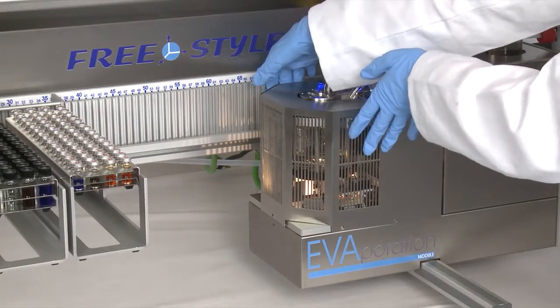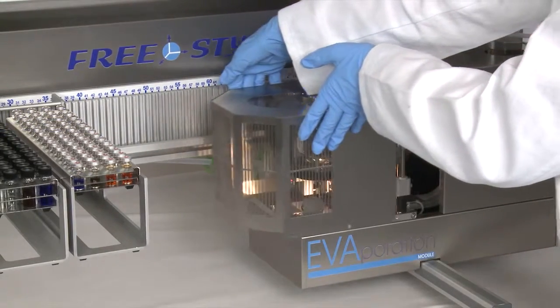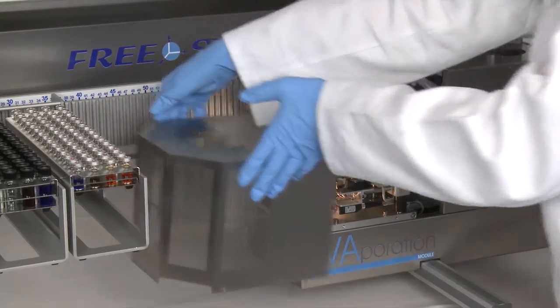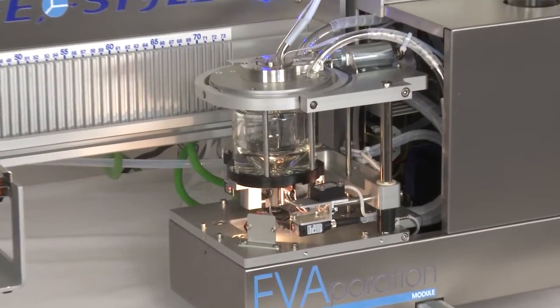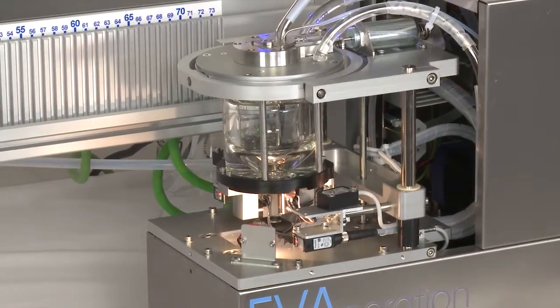In the following we will show you several details that are unique to the system and are incredibly advantageous for you as the user. To give you a better view let us remove the cover first.